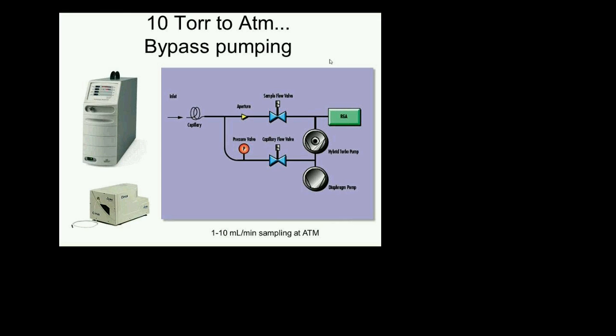And of course, once we go on the RGA side and it comes to looking at the spectra and all that, the same exact rules apply. You will always have a background spectrum in this system, right? When you close all the valves, and when you add the gas, you will have to subtract the background spectrum from the gases that you're bringing in. The background spectrum will have the usual suspects because most of them will ask you to degas the RGA or to bake out the RGA during the process. So it's kind of the same rules apply.